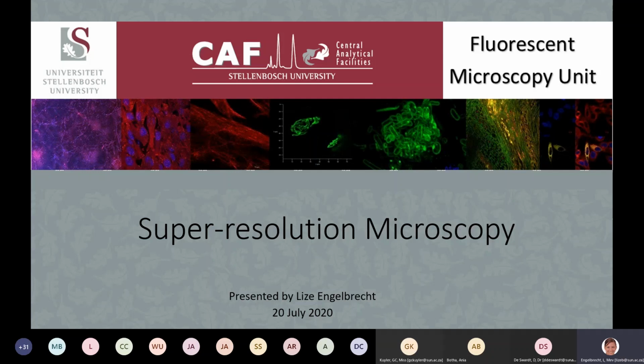And with a light microscope, especially fluorescence microscopes, you can identify specific proteins based on the dye that you've added to that protein. So light microscopes have their space, but the problem is they don't have the resolution of an electron microscope.